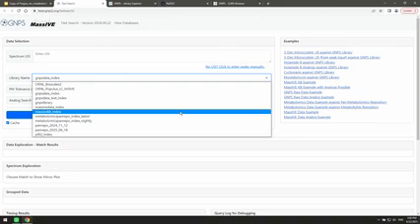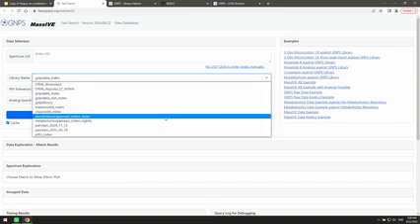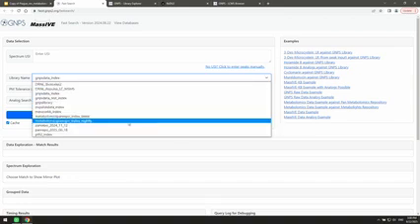So if we index only a certain set of this data, then you will only be able to get hits against that certain set. And what set we selected is what's represented here by this library index. So the most up-to-date one typically is this one here. The nightly one, that one should update, like it used to update every night, so that's what's called nightly. At this point, the intervals are a little bit bigger, it changes from time to time, but that's generally the most up-to-date one.